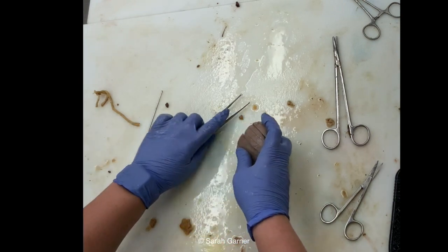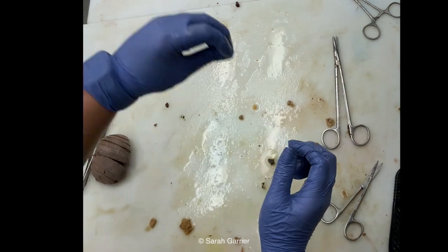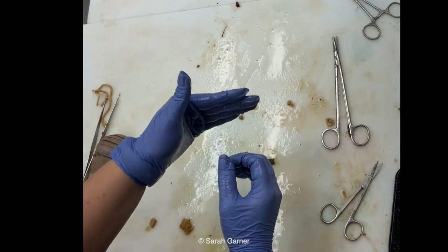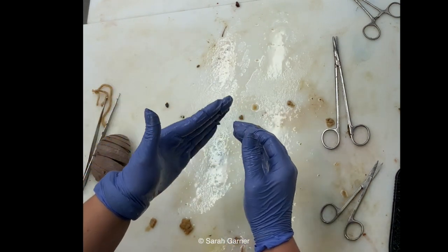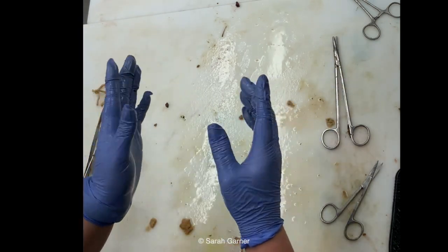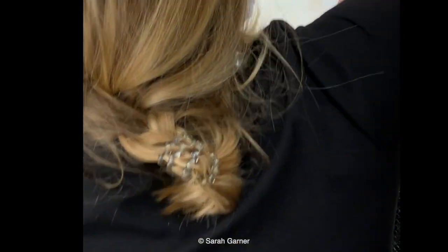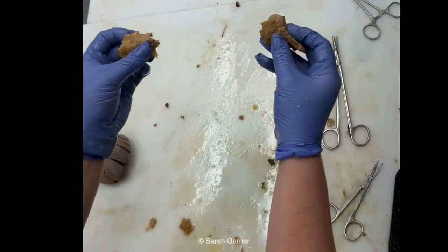So to review, our first step to separate our blocks was to reflect the aorta up, reflect the esophagus down, and then cut the two blocks apart by cutting through the inferior vena cava and then any other attachments, mainly attachments to the diaphragm, right? Then we separated them, and we got our abdominal block. The first thing you want to do on the abdominal block is find those adrenals. So the adrenals we did find, this would be the right and left adrenals.